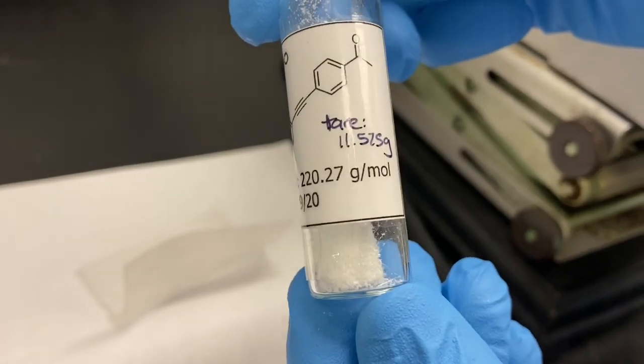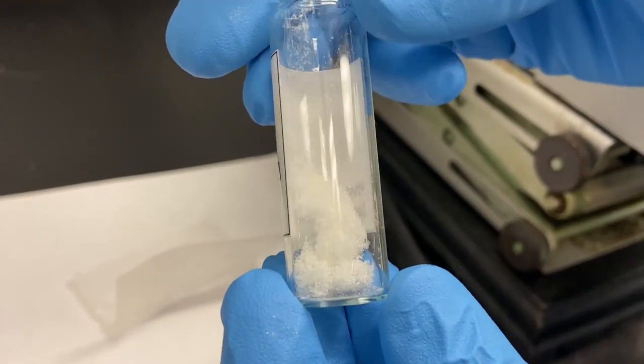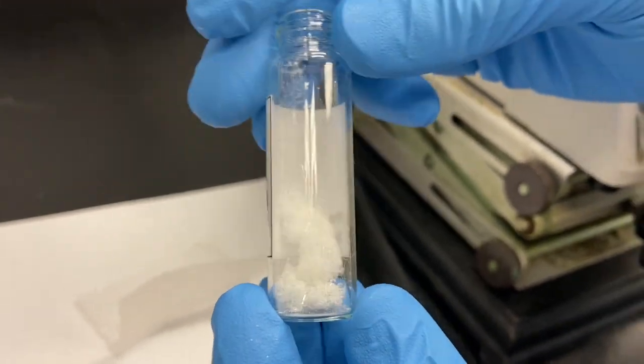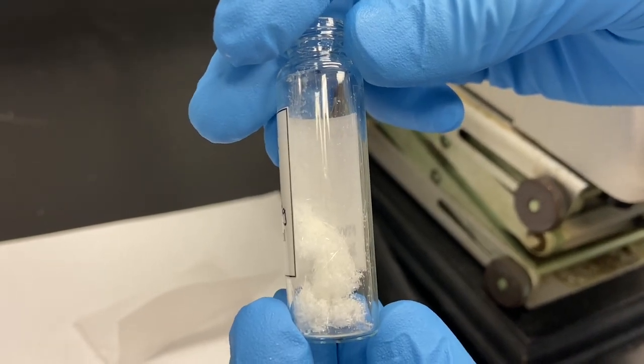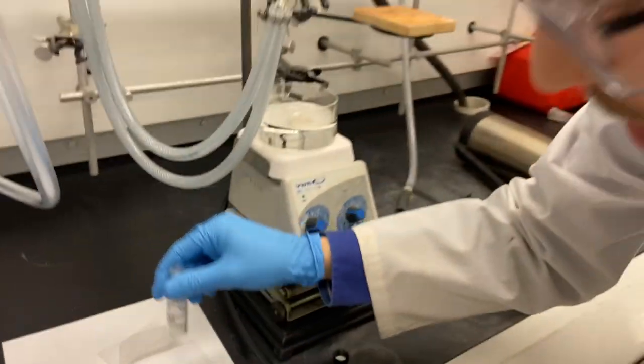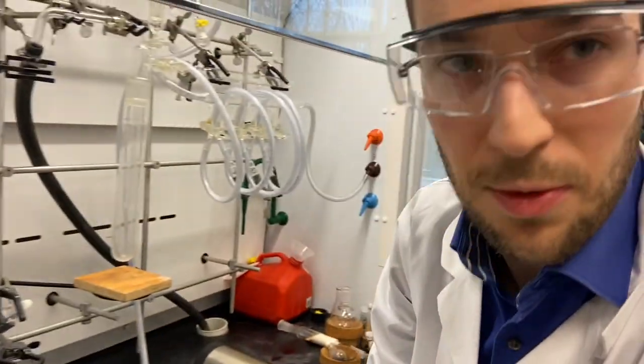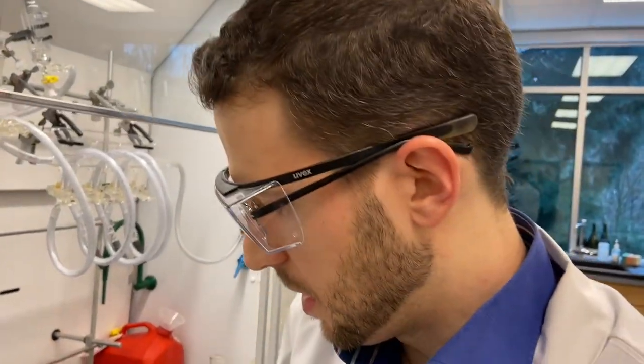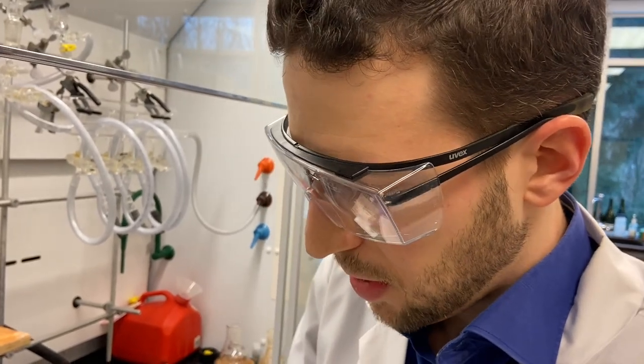It's the freshly sublimed product. We'll do some NMR and check for purity. When you do this, try to note down at what temperature and what pressure you sublime the material, and you can use that for your characterization.